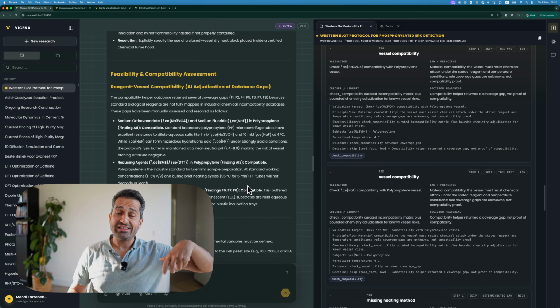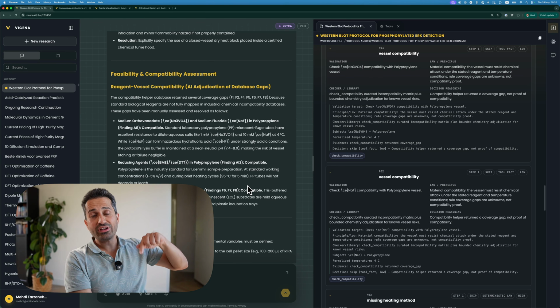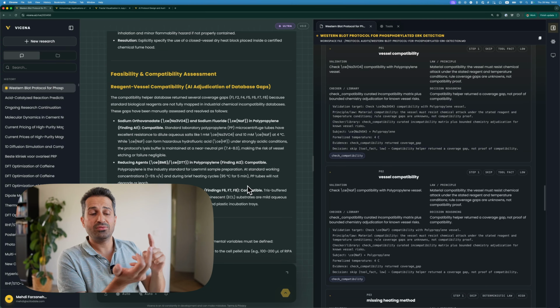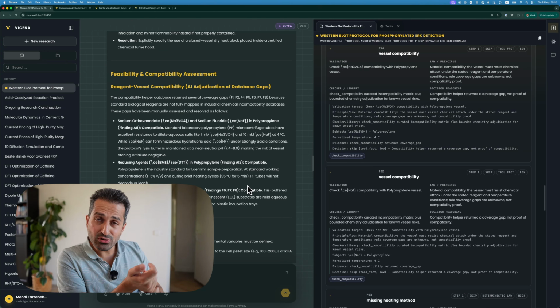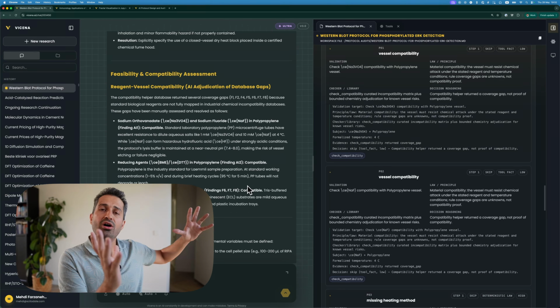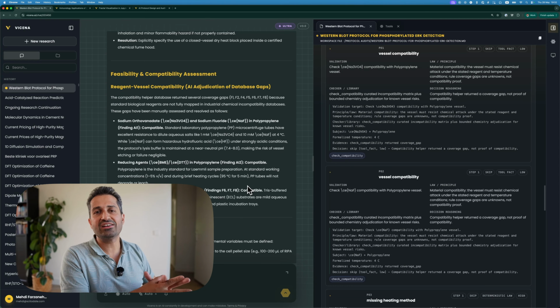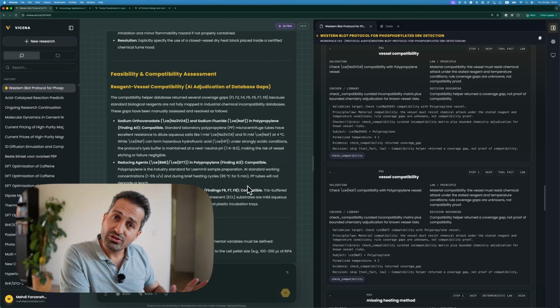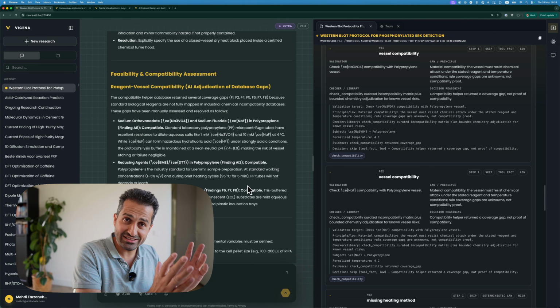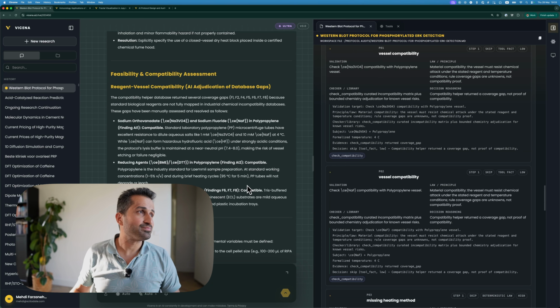So you can iterate. Now you can pass this on to the protocol builder to create a new version of the protocol, and then you can audit it and so on and so forth. So you can save a lot of time, resources, materials before going to a lab, so you can make sure all the things are taken care of. There is no catastrophic failure that you could have avoided before going to the lab. Of course, you need to use your own judgment. This is a tool, but you are the expert. So please use it with caution.